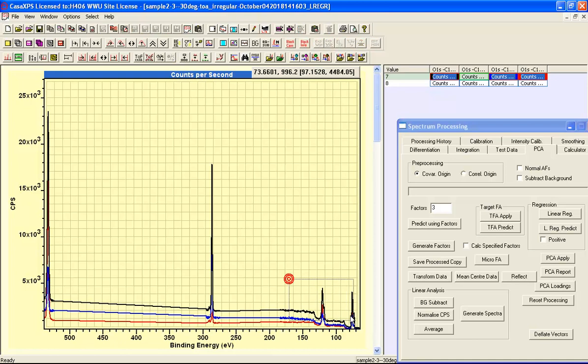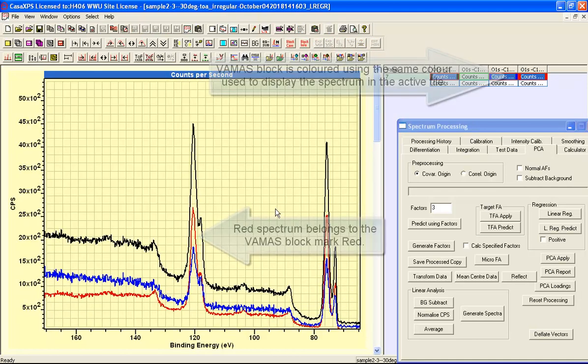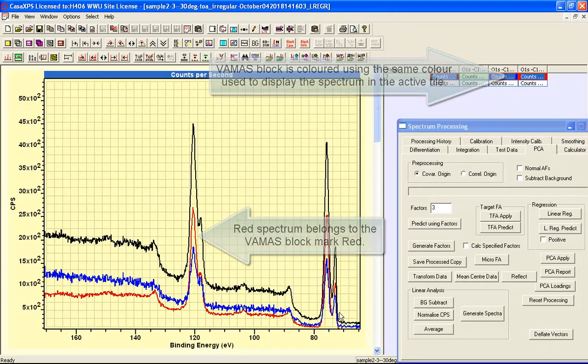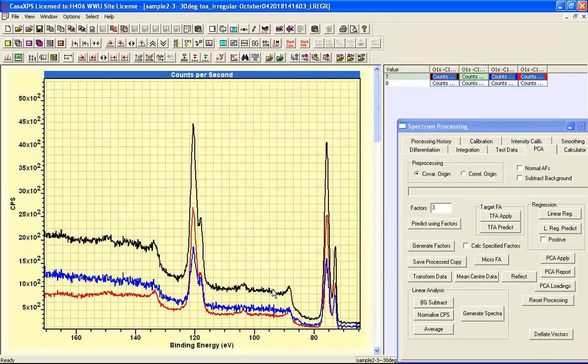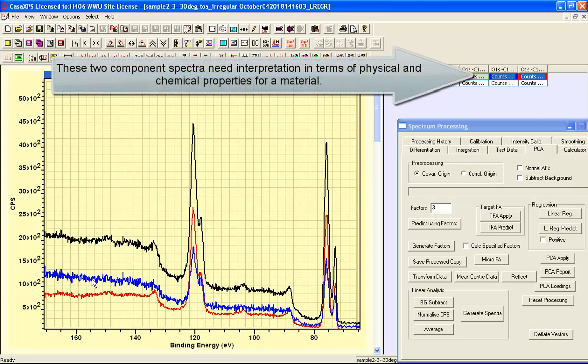If I zoom in onto the aluminium, you can see that the component spectra have the high resolution information in terms of oxide and metal peaks. But we have a breakdown of the original data in terms of a sum of these two component spectra. And the problem now is to understand how these component spectra relate to the original samples.